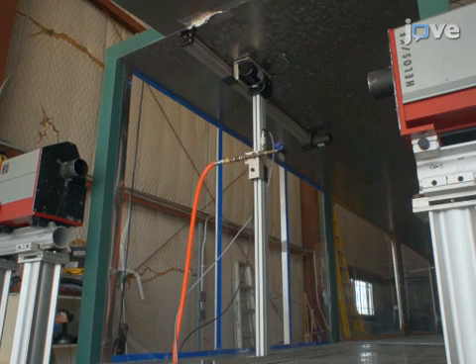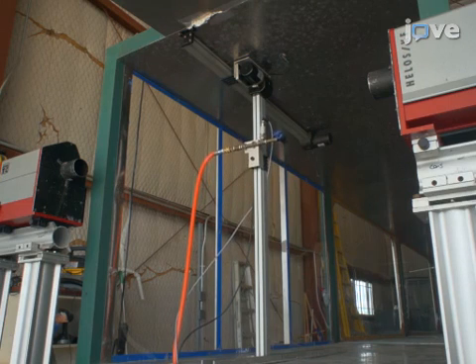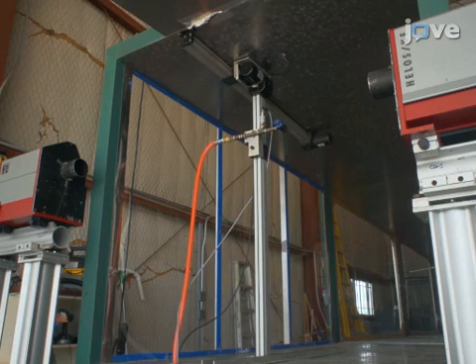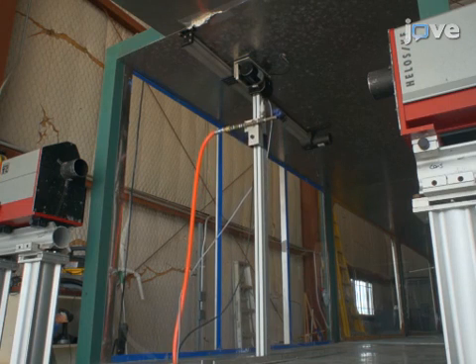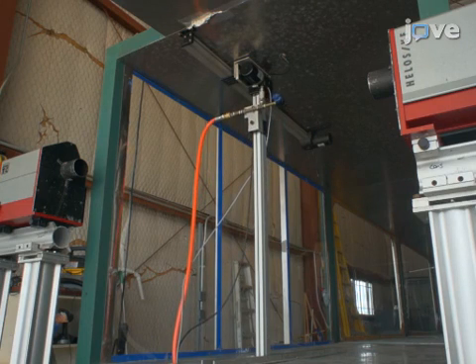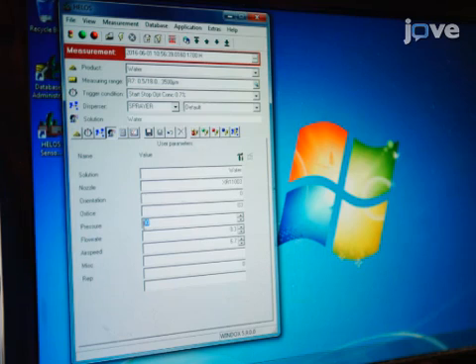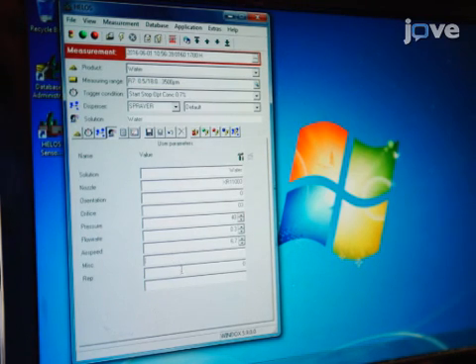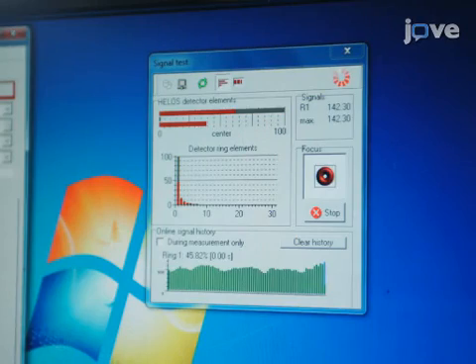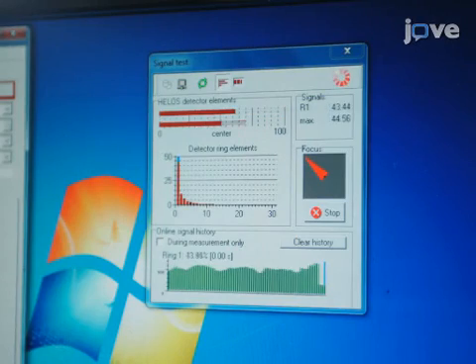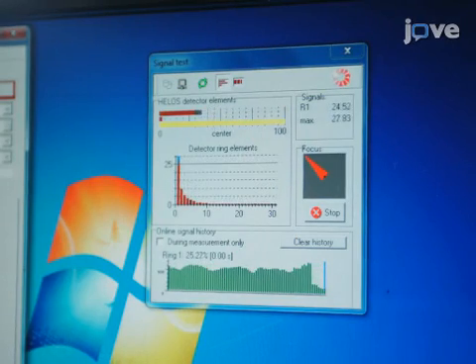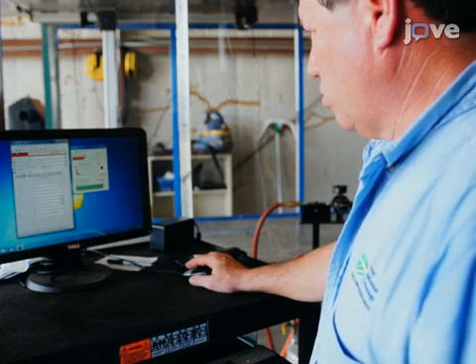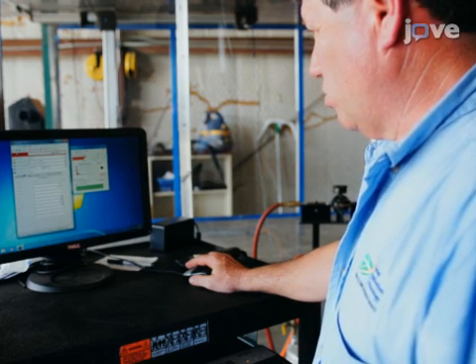At this point, activate the linear traverse to position the nozzle at its highest possible position. Enter all the experimental parameters into the laser diffraction system software. Next, perform a reference measurement to account for dust and background particles.